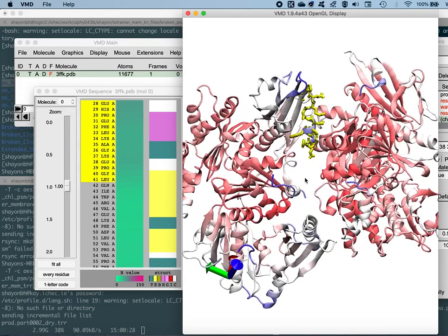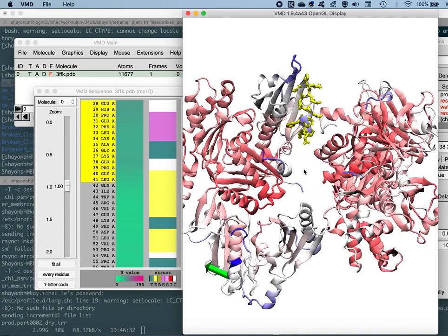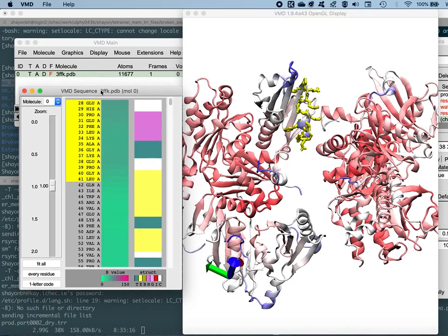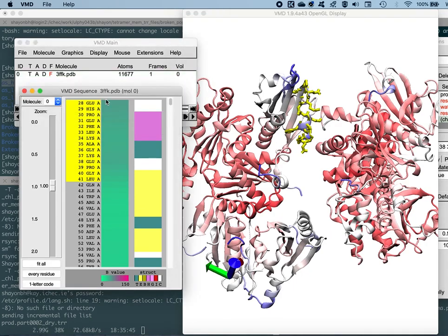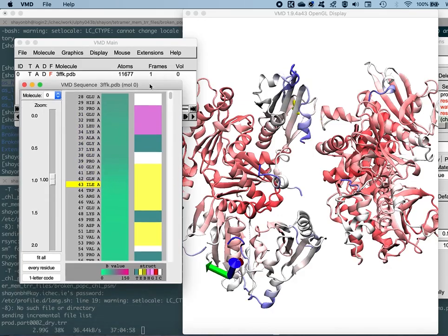So that's great. That's like another validation check, just to see whether the annotations by the B values, the coloration by the B values, matches up with the coloration that we have with the sequences. And they do. So you find all these regions blue in color, which means these are fluctuating in nature. And that's why they have the shade of darker green on the sequence viewer. Okay. So you can deactivate this by clicking anywhere else.